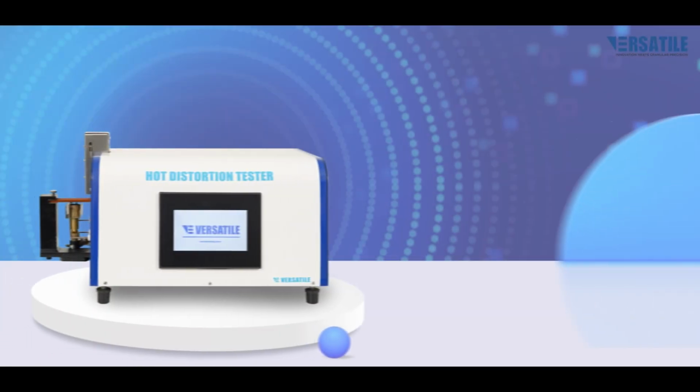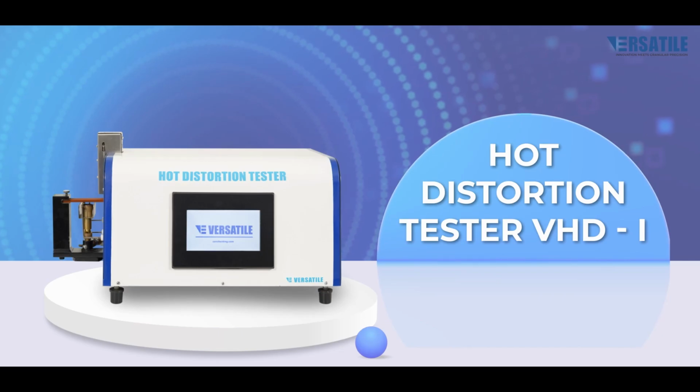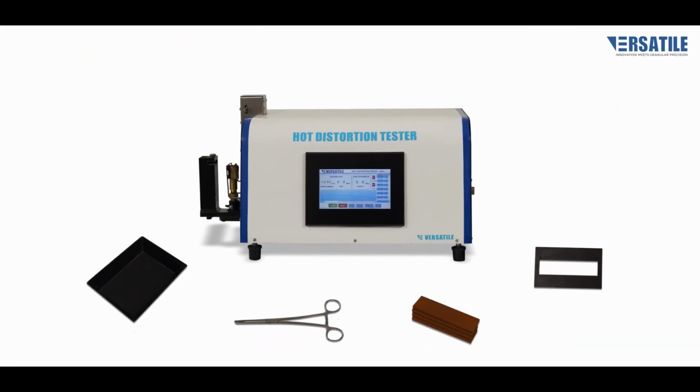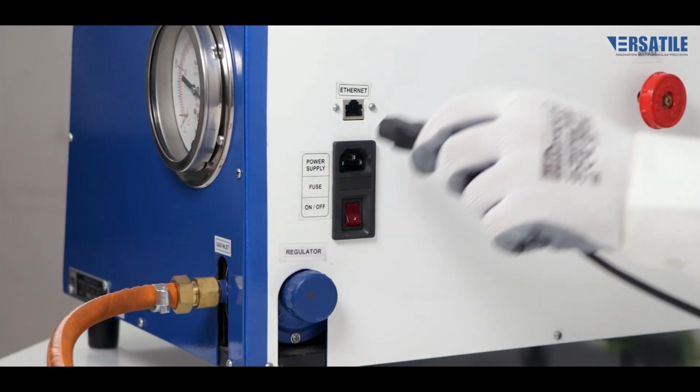Hot distortion test is one of the very few qualitative tests to gauge quality of resin-coated sand or cold box sand cores. In this video, we will see how the hot distortion test is done. Now, let's go through the equipment setup process.